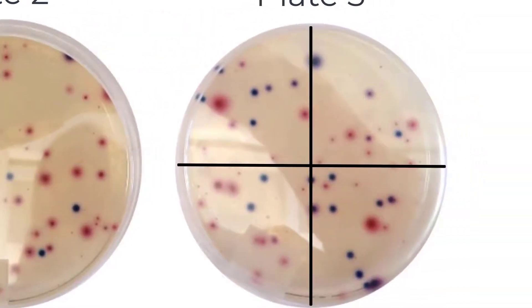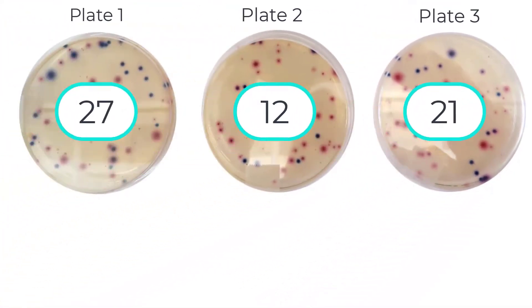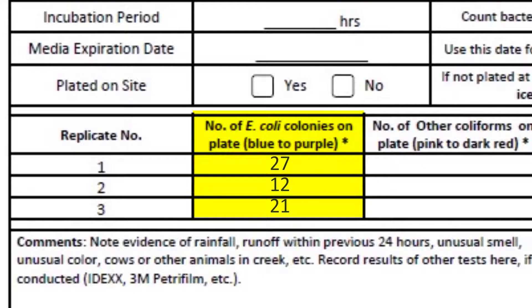Now let's count the final plate. Counting together: 1 through 21. There are 21 E. coli colonies on this plate. Record the number of E. coli for each plate in the corresponding section in your data form. We will record 27 for plate 1, 12 for plate 2, and 21 for plate 3.